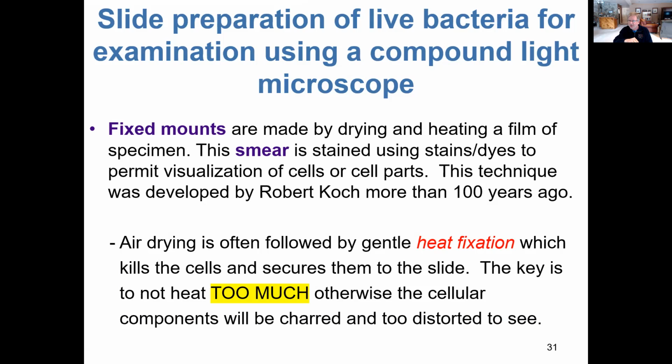If you take the bacterium from a solid or semi-solid material, you would have to first add sterile water to your slide, and then add your inoculum, your loop full of bacteria, for example, and you'd mix the bacteria with the water, because if you didn't do that, there'd be just too many cells. It'd be way too concentrated. So the idea is add a couple loopfuls of sterile water first to the slide, then add a loopful of bacteria, and then mix that a bit, spread it out on the surface of your slide. That's allowed then to air dry.